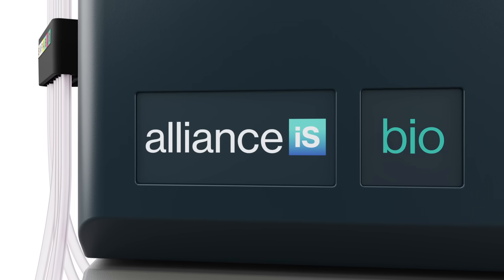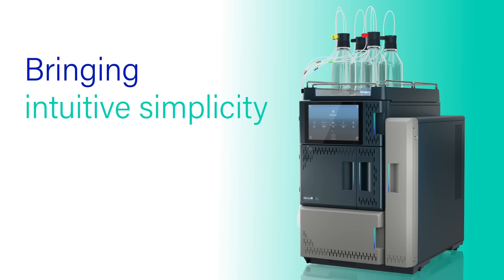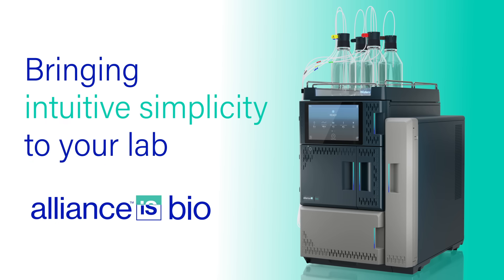Your new lab ally for bio-separations is here, bringing intuitive simplicity to your lab. The Alliance IS-Bio HPLC system from Waters.